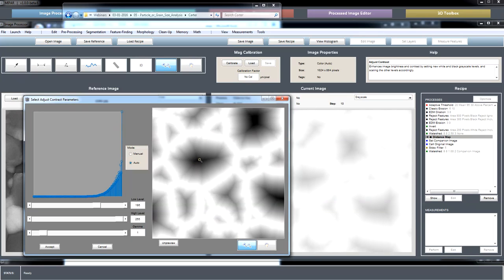Now if you imagine this distance map as a topography map, so you basically invert the distance map so that high distance values are deep valleys in your topography map. So you've got a pit here, a pit here, a pit here, and you then run a rainfall simulation on this imaginary topography.